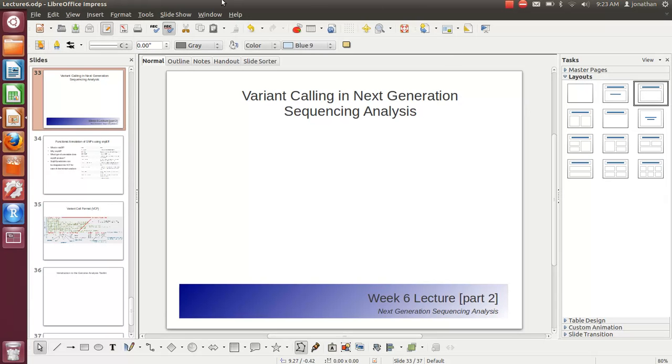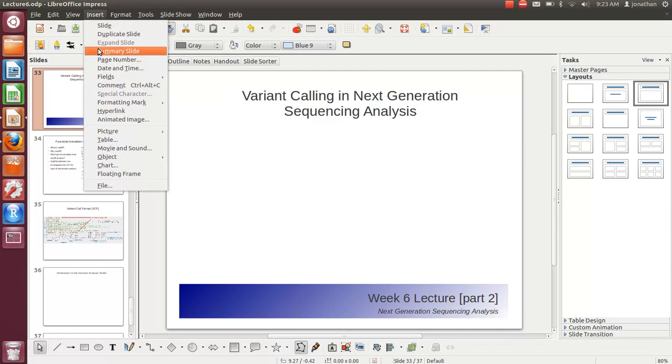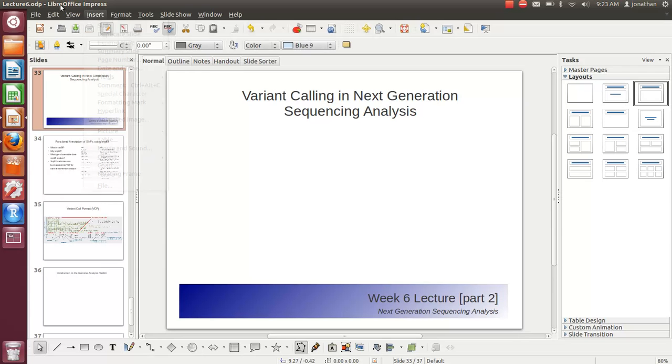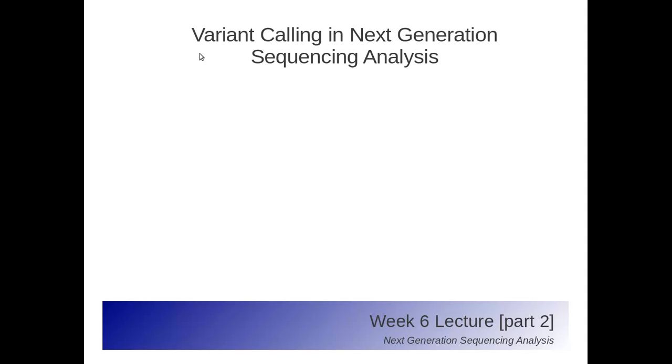Hello, and I guess this is the second part of the week 6 lecture for the next generation sequencing class. This is a relatively short set of material that I just want to go over, in part to help you with your homework, including getting familiar with the VCF format and providing you with a small introduction to the GATK, or the Genome Analysis Toolkit, website.